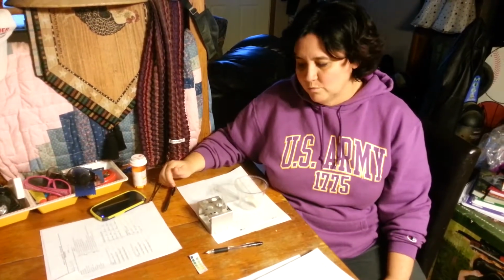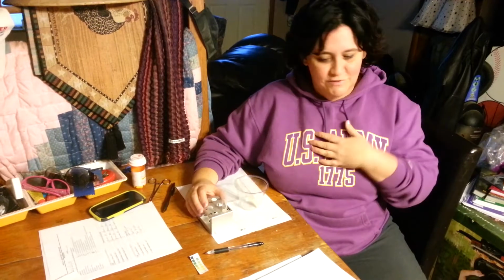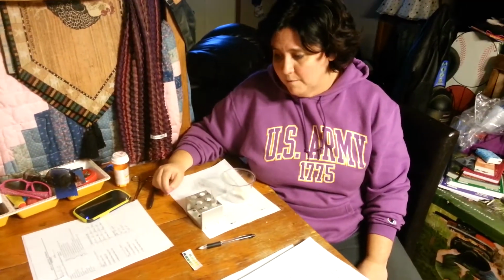I chose the Amylase, one that we used in our experiment. We used 4 tubes. We used spit and distilled water to figure out the tubes. And Amylase, just to give you a little background, is an enzyme that's found in everyday saliva. It helps in the breakdown of starches into a sugar. And it's used throughout the digestive system.